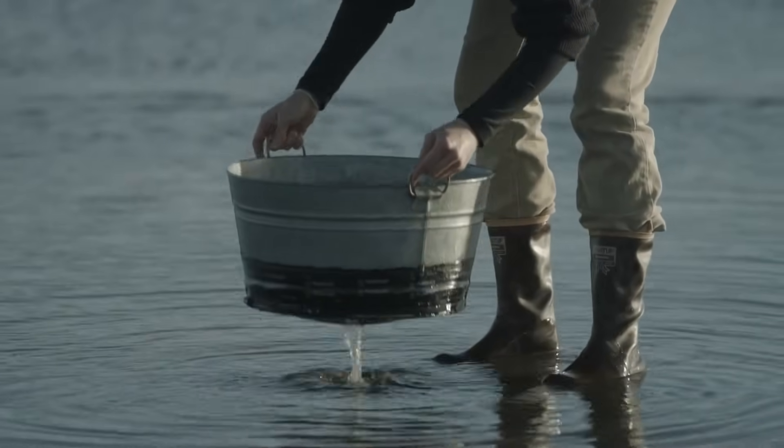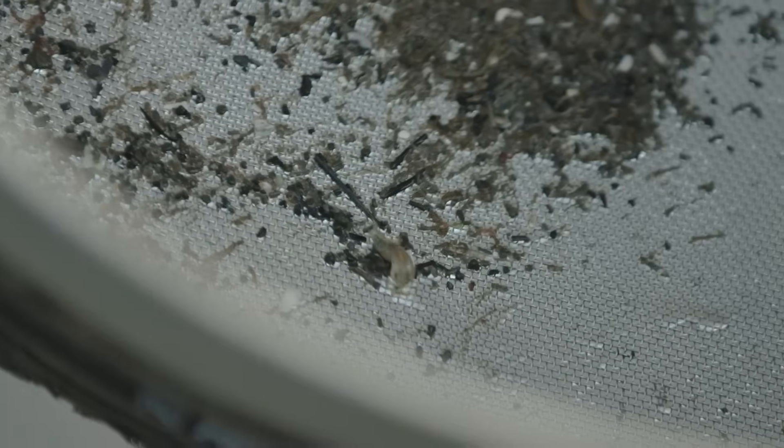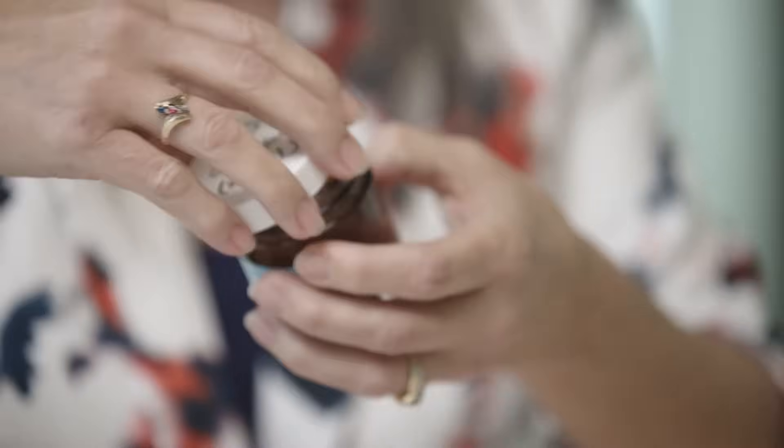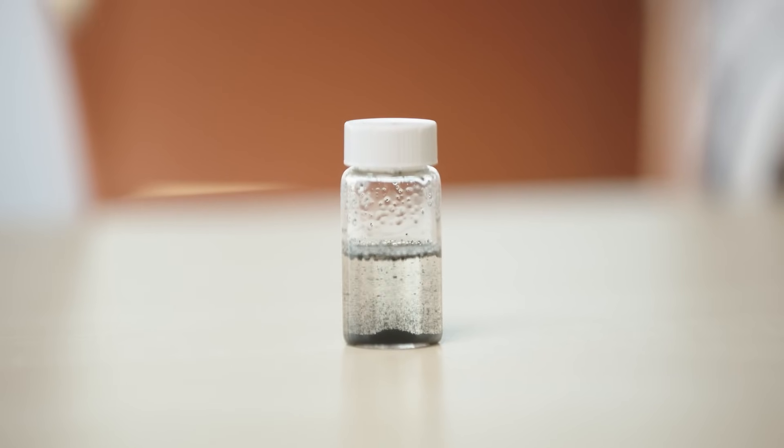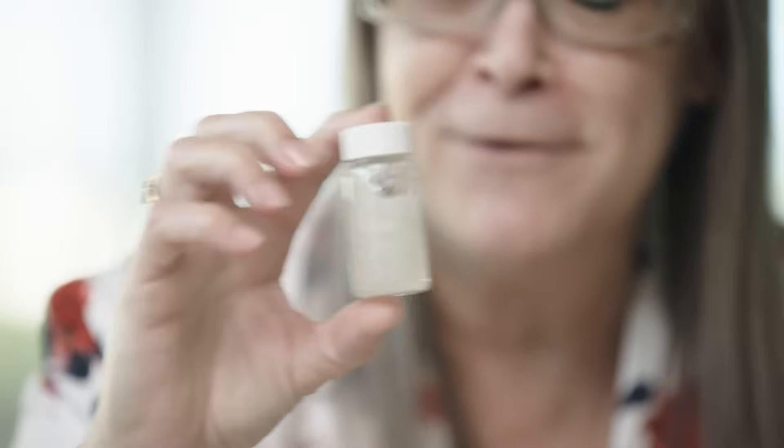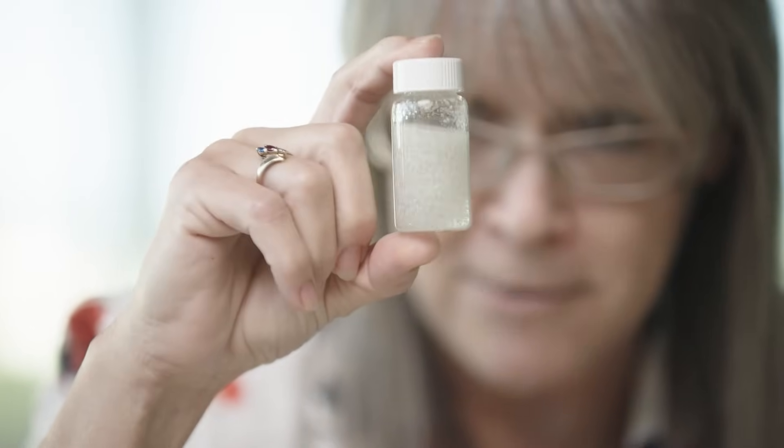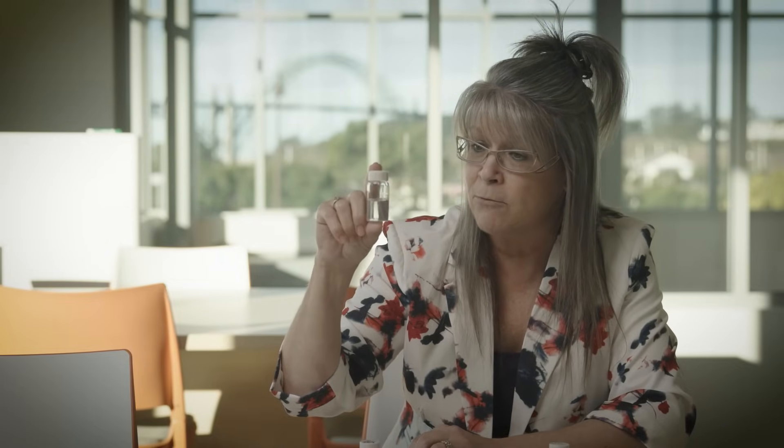From the cryo mill we generate these powders from everyday consumer products. This is a polypropylene straw, so a traditional plastic straw. If you add those in water you can see they don't like to be in water, they're climbing right up the side. If you add some organic matter in there though, you can see that they stay way more stabilized and your exposure is going to be much more stable. This is microplastics, so these are polypropylene straws broken down to the micro scale, so you can still see the particles in there. If they're milled down to the nano scale, this is what they look like, so you can see there's nothing in there.